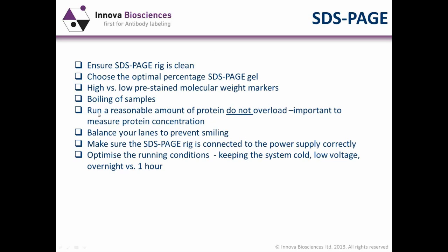And although this may sound obvious to you, make sure the SDS-PAGE is connected correctly to the supply. I've done it before. I've been in a hurry to get out of the lab, running a gel overnight, and I connected the negative and the positive to the wrong connections. I couldn't understand why my gel hadn't worked in the morning, when all I'd done was run the system backwards, so that instead of the proteins migrating through the gel, they'd just left the lanes and diffused into the top layer of the tank.